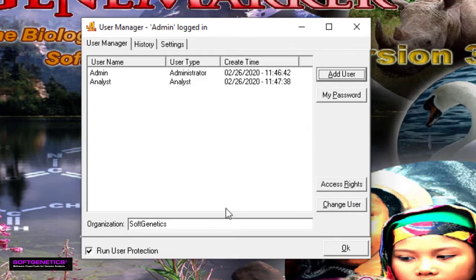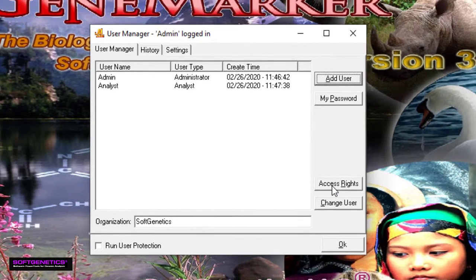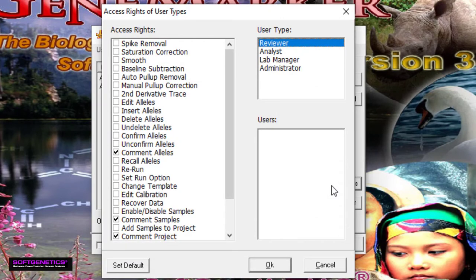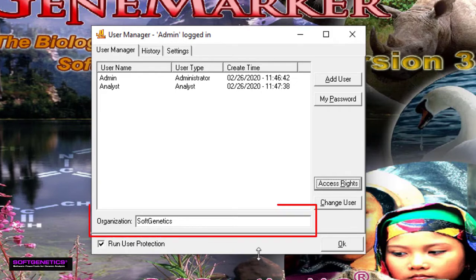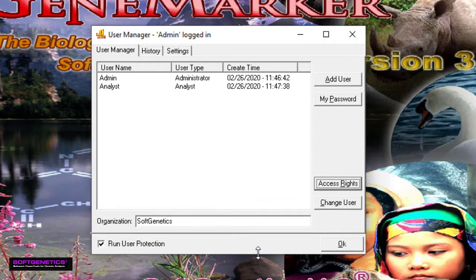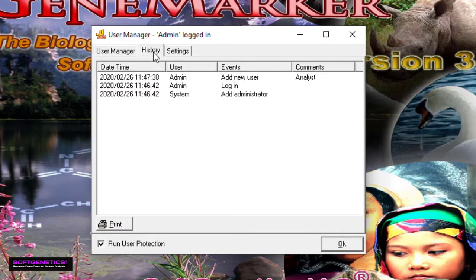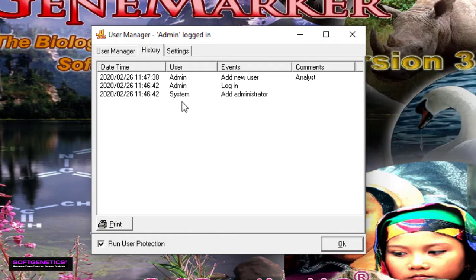The Access Rights button allows you to more finely adjust the abilities of each user to better fit their skill or position. The administrator can also input the name of the institution or lab so that it can be featured in the report header. Note that the program keeps an internal record of who uses the program and when. This can be viewed under the History tab. Furthermore, GeneMarker has a built-in audit trail, and user actions are documented and available for review.